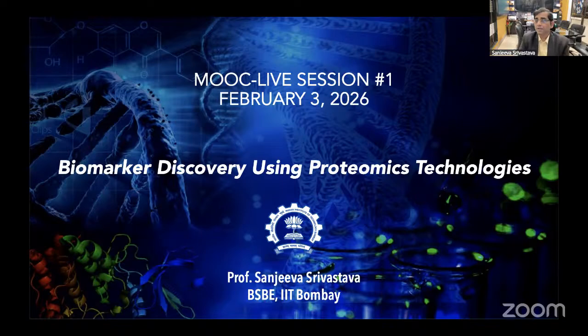So today we are going to take you from our lab, which is the clinical proteomics lab, and show you different technologies which can be utilized for biomarker discovery and other applications. So today's topic and theme is essentially how to identify and discover novel biomarkers and potential candidates using various types of proteomic technologies.